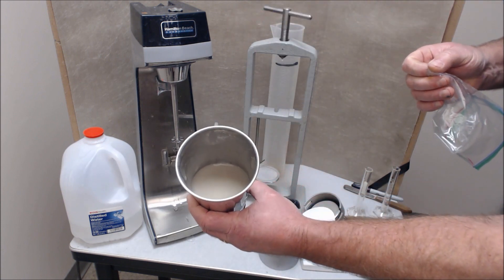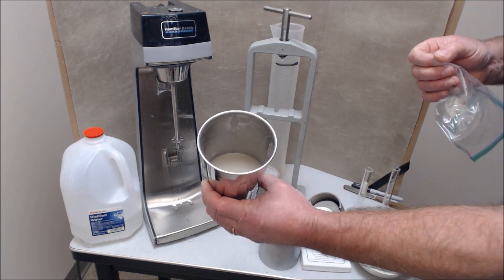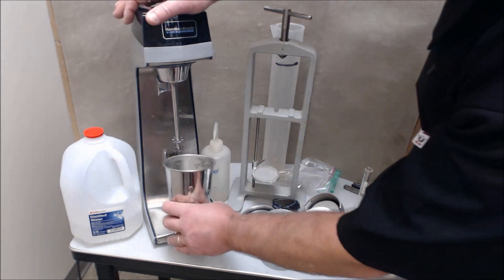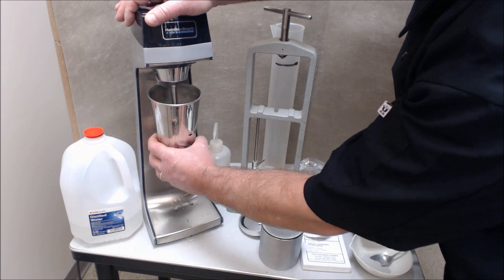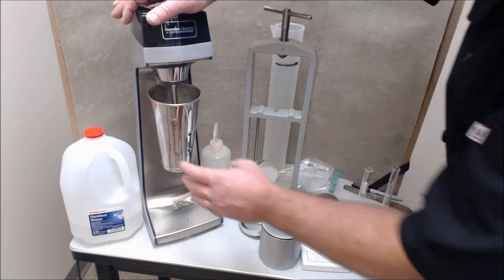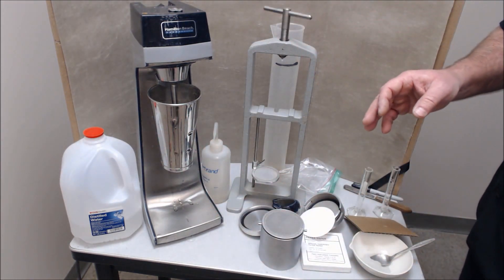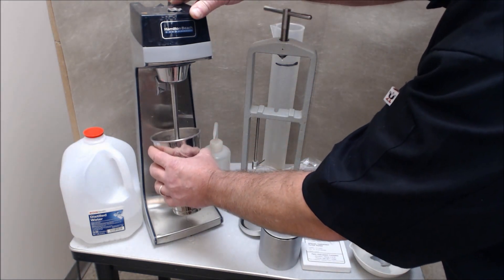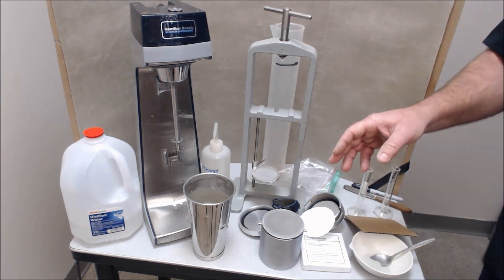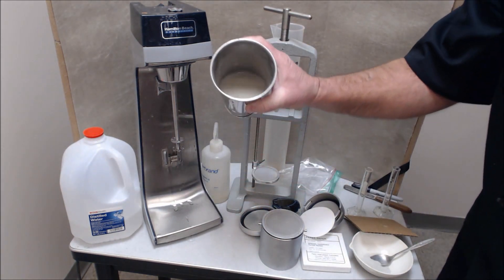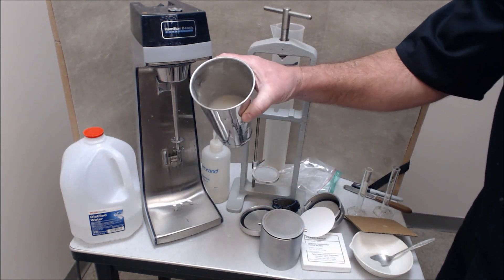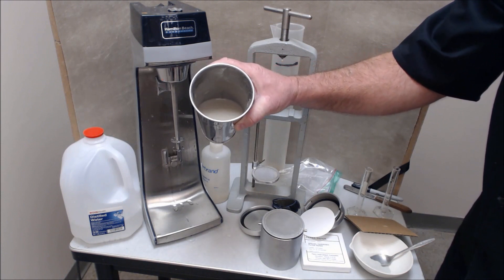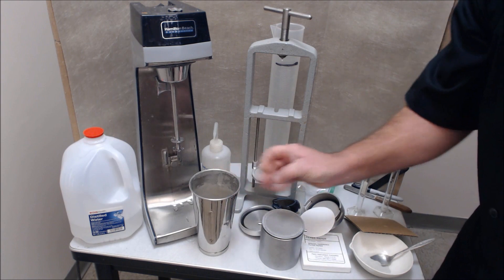Here's the gel that was prepared yesterday. Then you take this gel and you mix it prior to entering into the filter press. You would mix that right up until you're ready to go. Here is what the gel looks like of the distilled deionized water and the clay mixture which sat overnight.